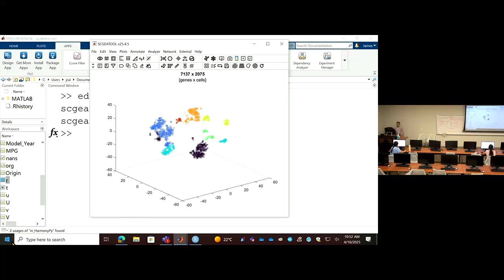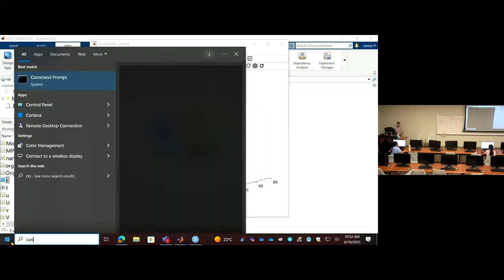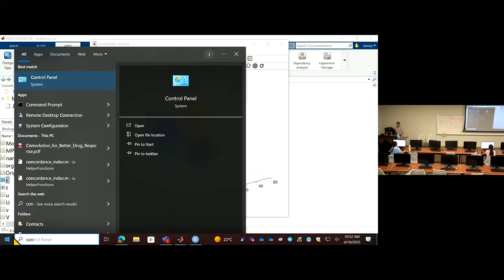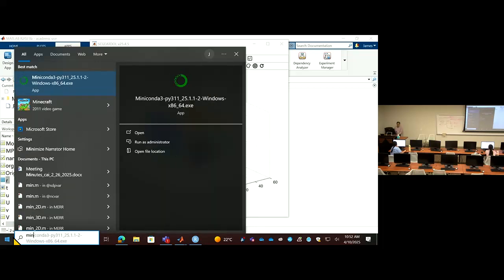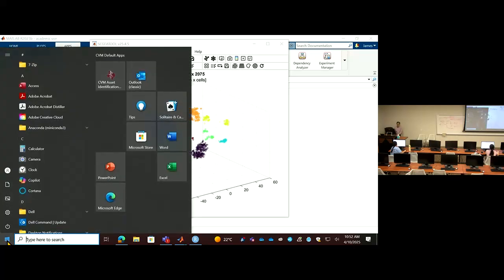So first, let's see, you have conda. Let me know if you have Anaconda, this one installed.